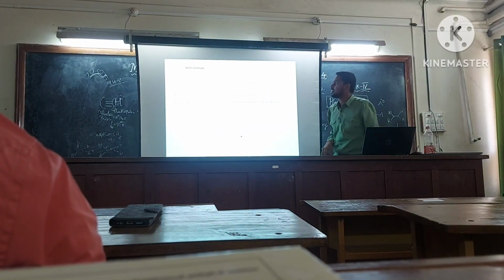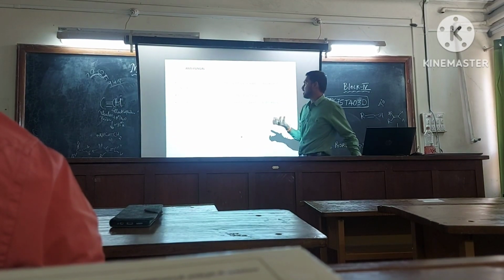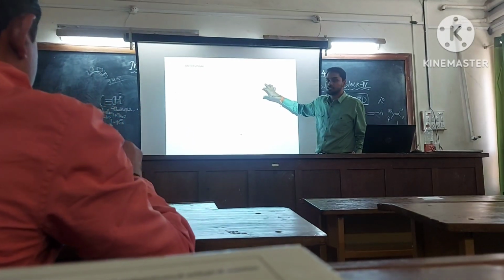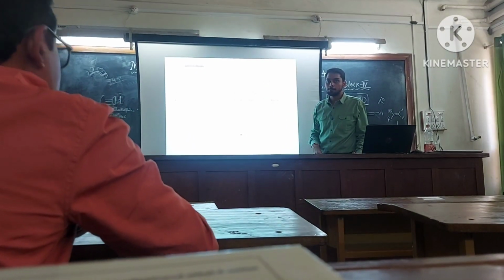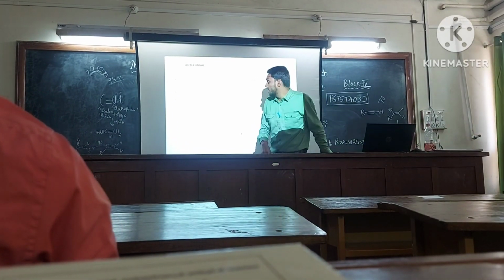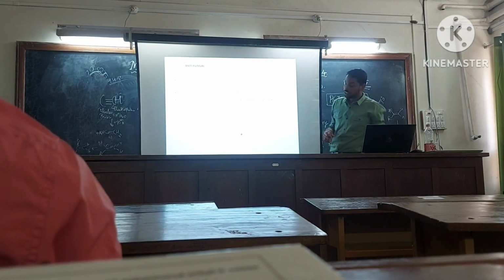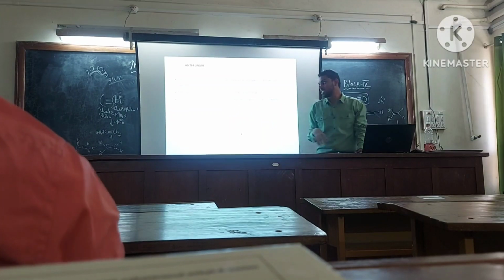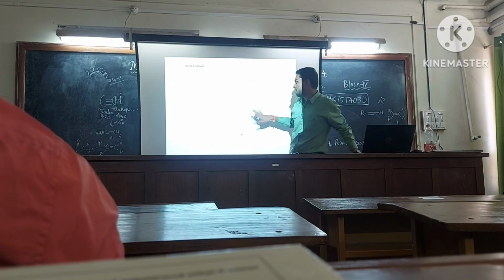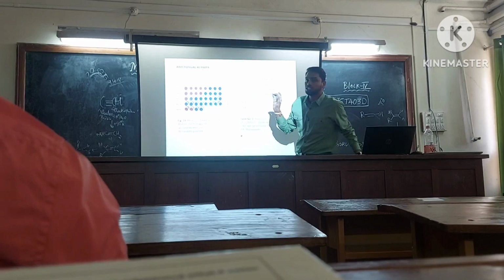So it is antifungal. Antifungal agents are going to act against the fungus. So here we used Candida albicans and Candida glabrata as the two standard fungi. We used fluconazole and itraconazole as the standard drugs. Copper oxide nanodrugs were twice as potent for Candida glabrata when compared to C. albicans. So this is the antifungal activity, as earlier mentioned, about MIC-MBC.